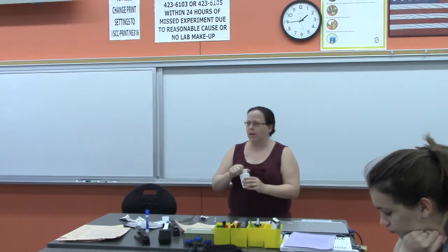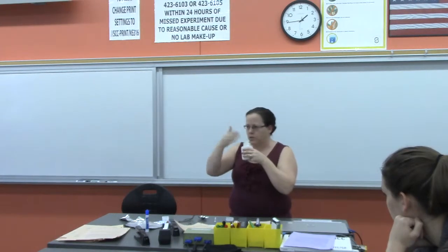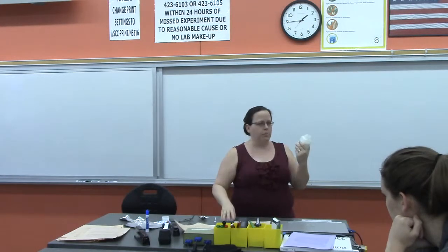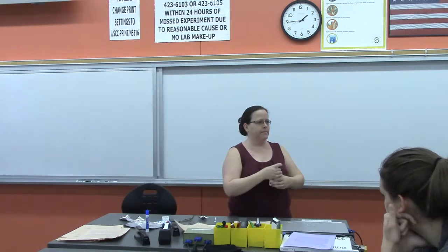Open them up and smell them. In chemistry, we never smell anything by shoving our nose into it, right? You waft it towards yourself. That's just in case it smells really bad. So if there's no odor, you can put no odor. If it has a smell, we want you to describe it, okay?